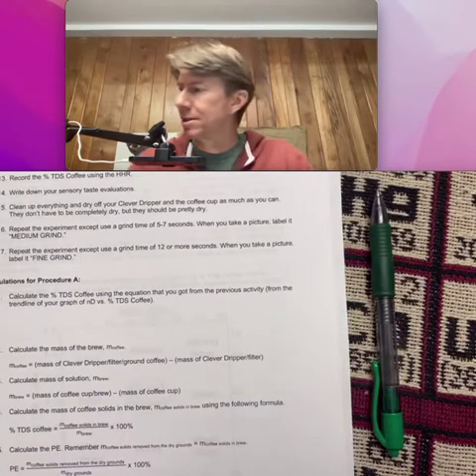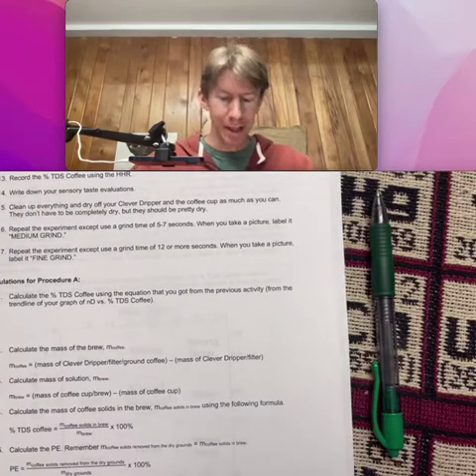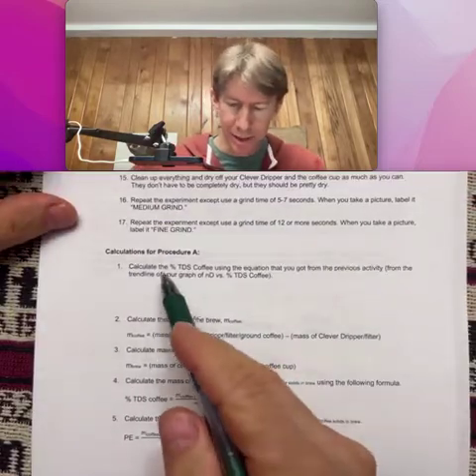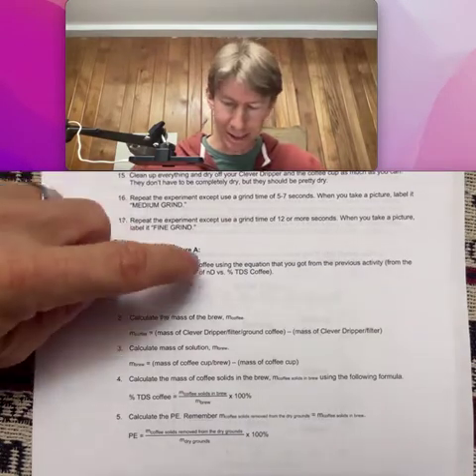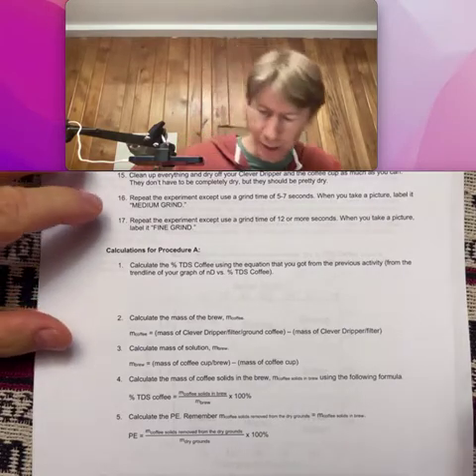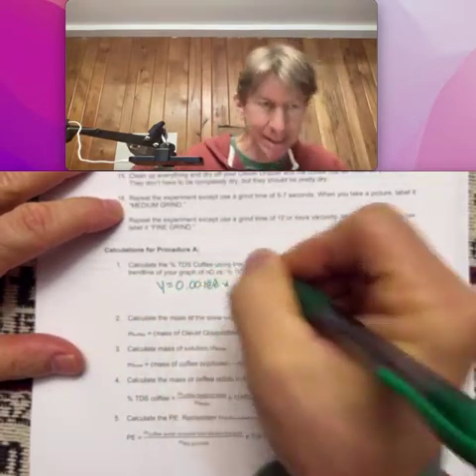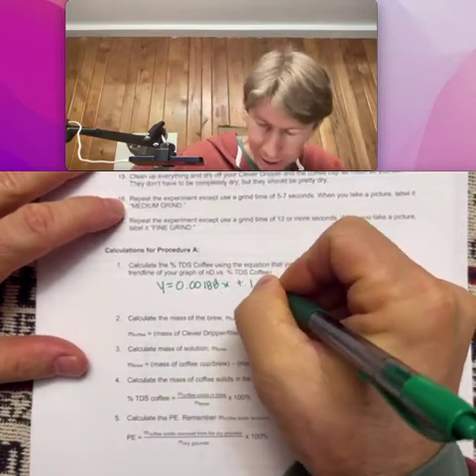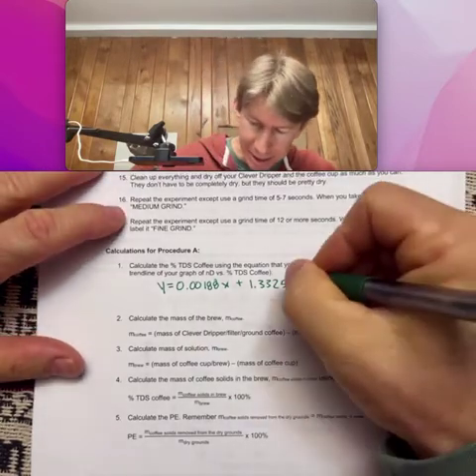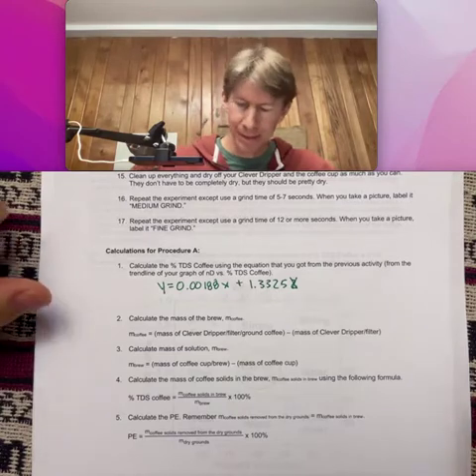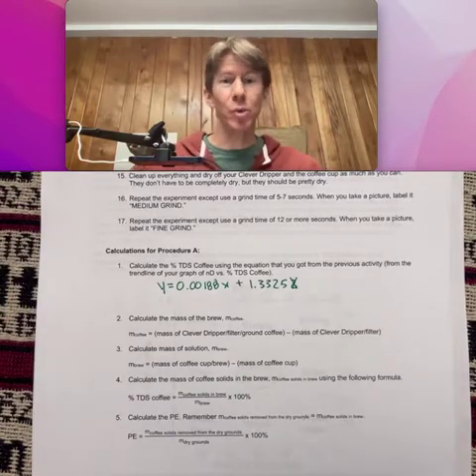The other two, the medium and the fine, I'm going to let you handle those. I'm going to go ahead and get to the calculations now. The calculations I'm showing right here, the first one is calculate the percent TDS coffee using the equation that you got from the previous activity, and that's from the trend line of your graph of refractive index N sub D, although my D needs to be subbed versus percent TDS coffee.